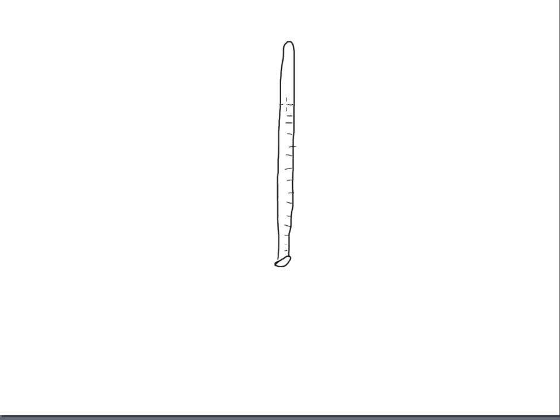The idea here is that in order to trap the gas, I need to make sure that it can't escape the eudiometer. I also have to make sure that I can trap it in there until it's ready to be pushed out. So what goes on is that I will take a bowl, some type of heavy bowl.